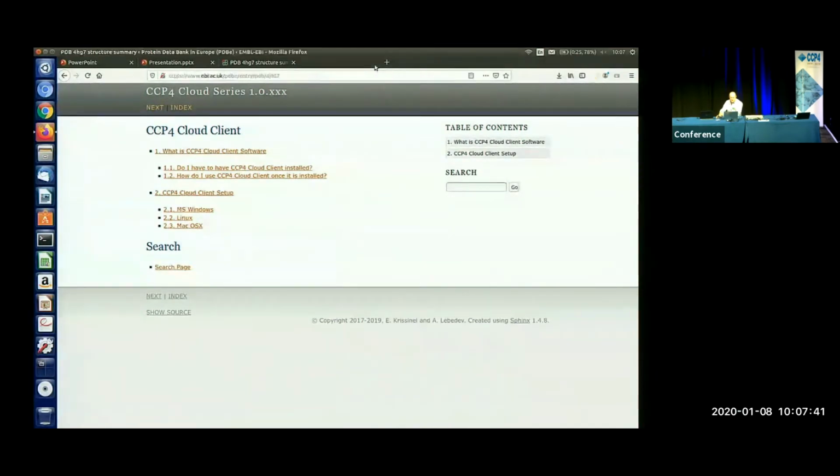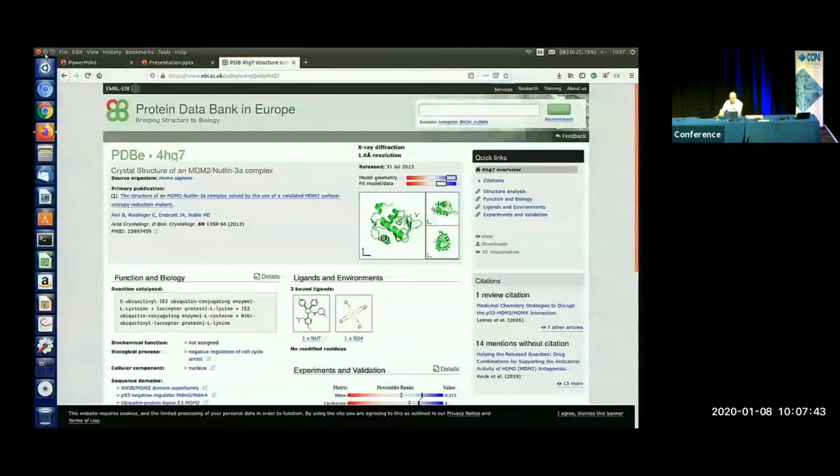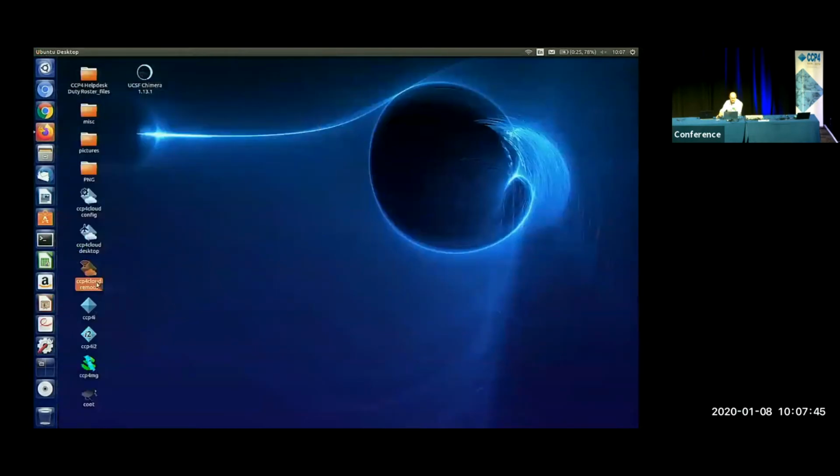And once you install that, you end up with these three icons on your desktop. One is just for configuration, and then these two are the two different ways you can run it. You can run it locally using this desktop icon, and the plane here is meant to symbolize airplane mode, as if you were in an airplane.